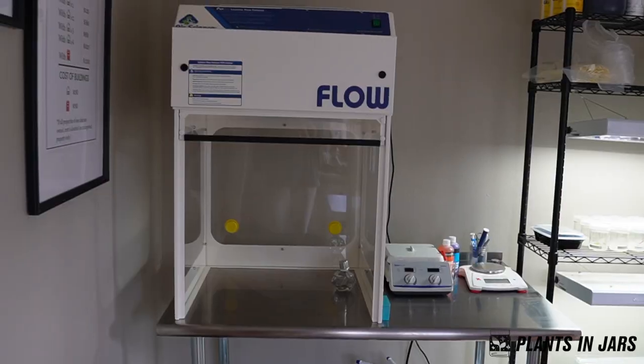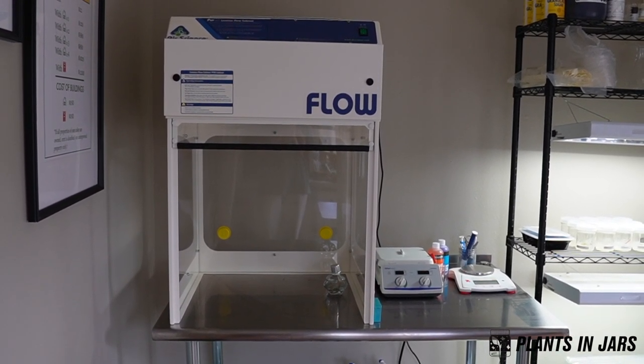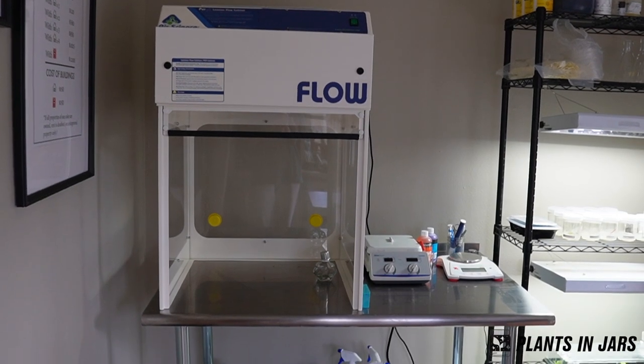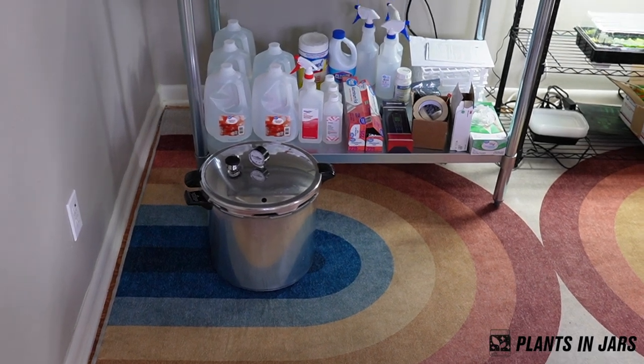Today I just wanted to make a really quick video showing you my tissue culture lab setup. This is my favorite room in the entire house — it's also my office. If you've watched my videos you've seen the laminar flow hood. I use a 2x2 Air Science laminar flow hood and then I have all sorts of storage below it, and the pressure cooker is sitting there as well.